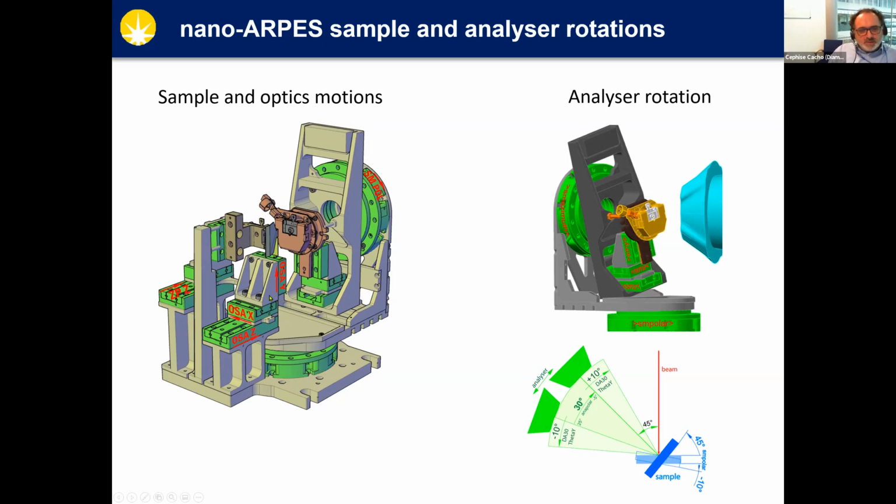We also have a capillary mirror, which is a different technology. And there are 2 other degrees of freedom. So this is inside, in the center of the experimental chamber. And you can just adjust it for the sample with the analyzer.